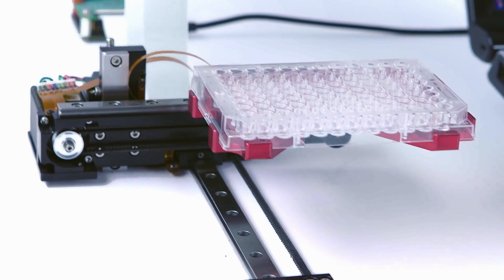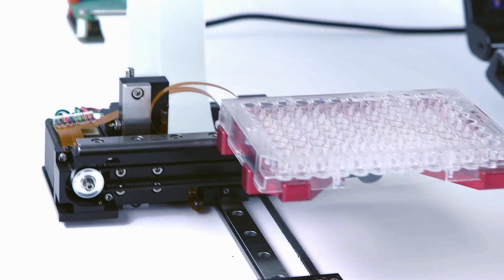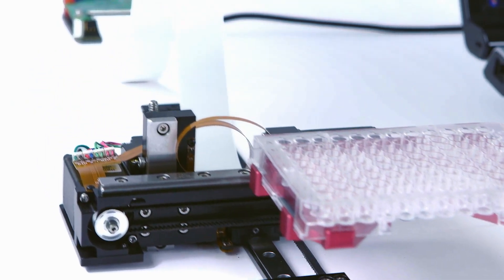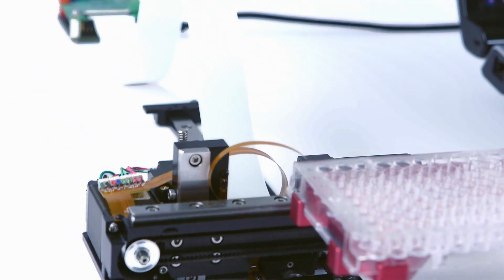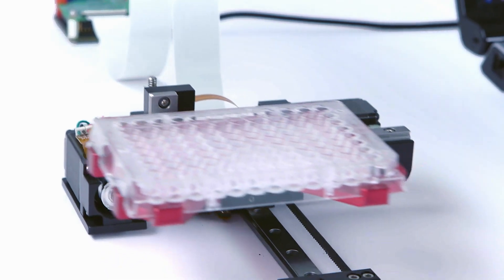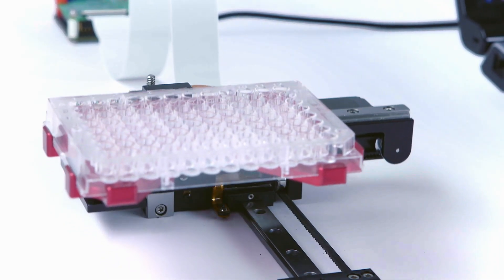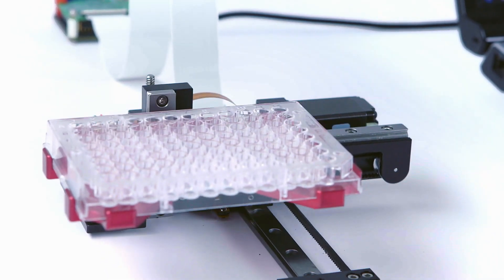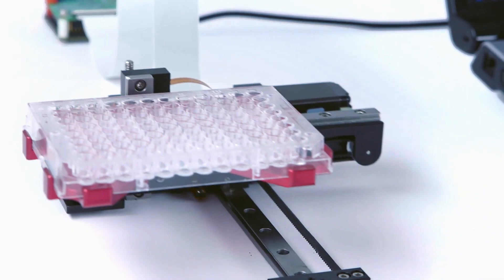Front to back, the robot has enough travel to access all the microplate wells and extend the microplate out the front of the instrument for easy load and unload access.